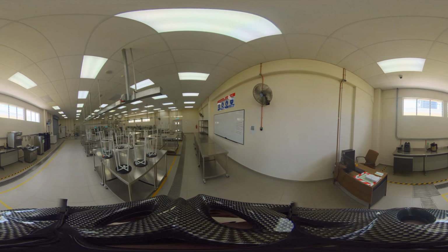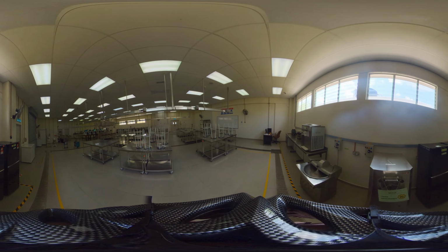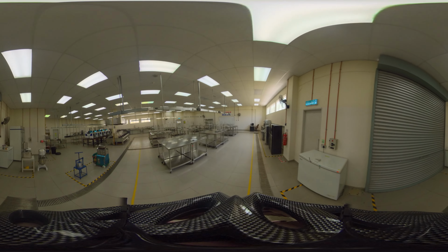Starting with the first hazard, you'll notice that the drainage cover is not in place. This can create a very serious safety risk, as it may cause slips, trips, or falls, and could lead to contamination if water or waste spills onto the floor.